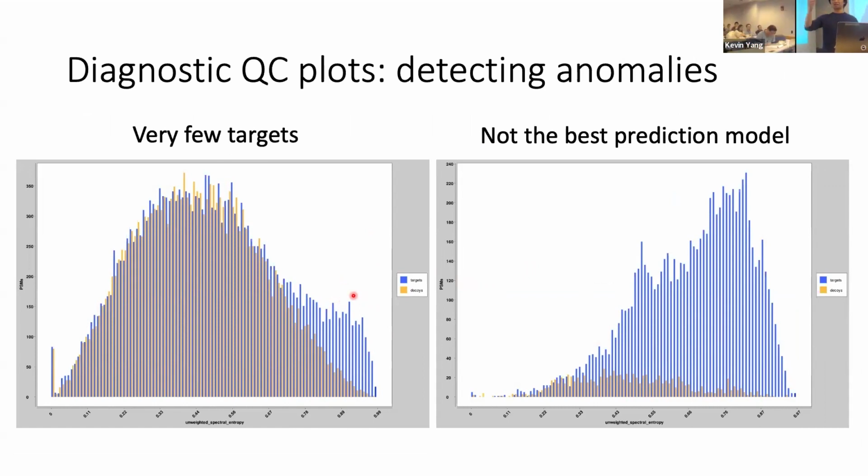If you do a lot of fractionation of your data, for example, maybe you just get the final couple of peptides eluting at the end. Another possibility is that maybe you used the wrong database. Maybe you have your human data set and you're matching to a very different species by accident because you forgot to change your database. Now you only get a few of these true positives because you're only getting a few of those homologous sequences. So that's one thing that you could learn from your histograms.